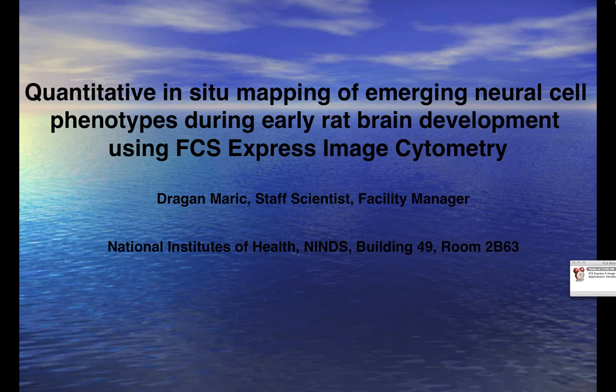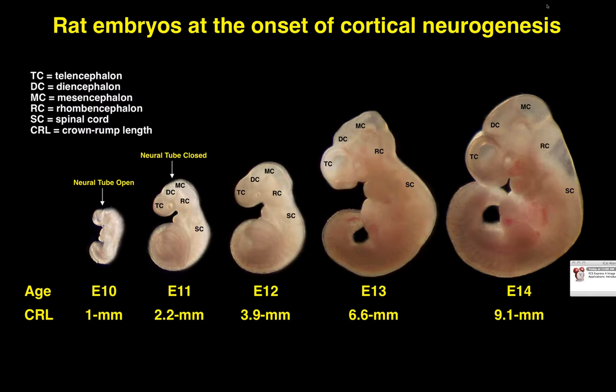As Sean has mentioned, we're mostly interested in neural cell development and CNS development, beginning with the early stages of embryogenesis all the way through the adult. To start with, the earliest forms are the neural tube. Can everybody see the mouse that I'm scrolling around the screen?